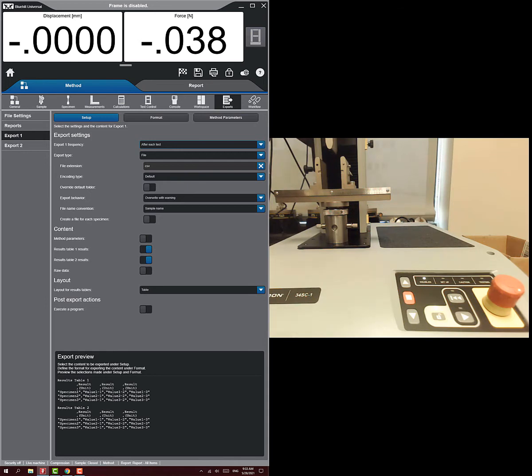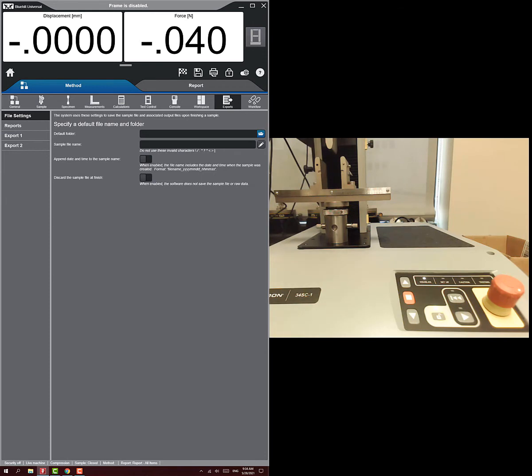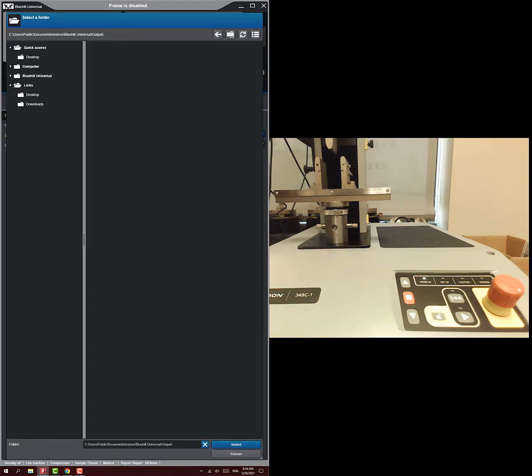You can uncheck the results table export — what you really want is the raw data table with time, displacement, and force. Export it as a CSV file. You can set a default folder; I'll set it to the desktop for now.